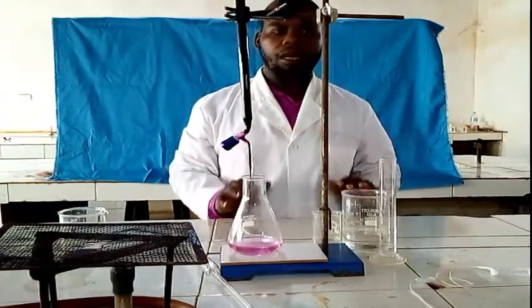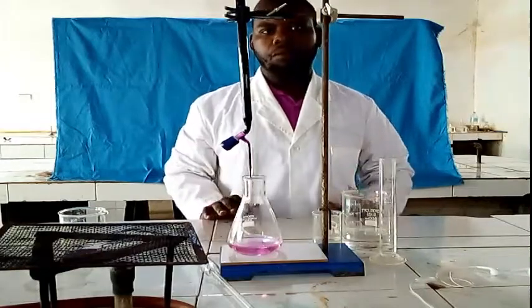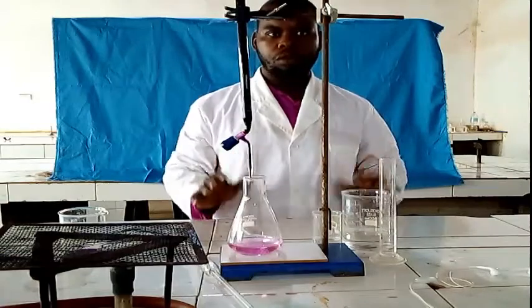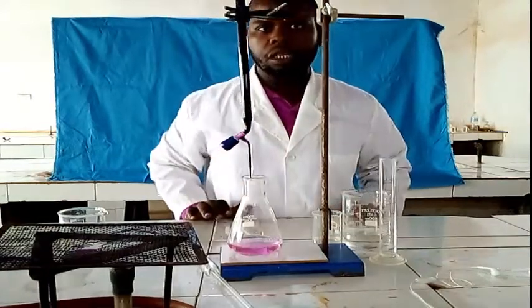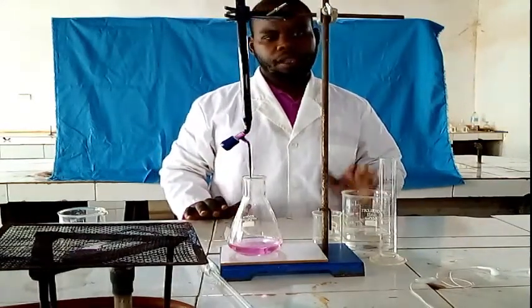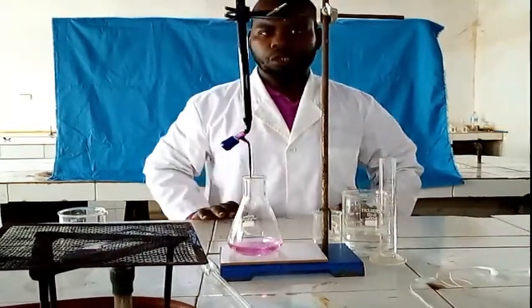I think that is our demonstration, our experiment. Let's go to the questions to see the solutions. Our volume here is 25. From 0 to 25, that is the end point for this reaction. Thank you for learning through this one. Let's go to the solutions.